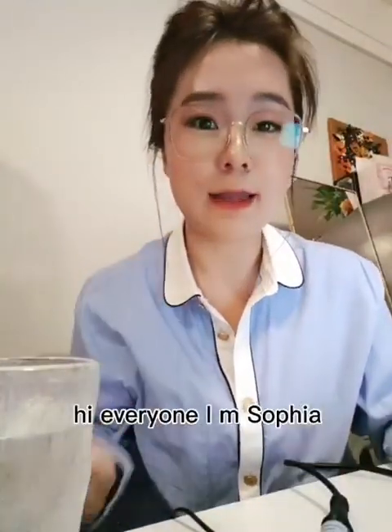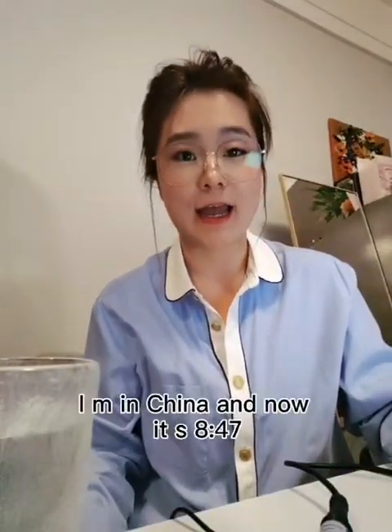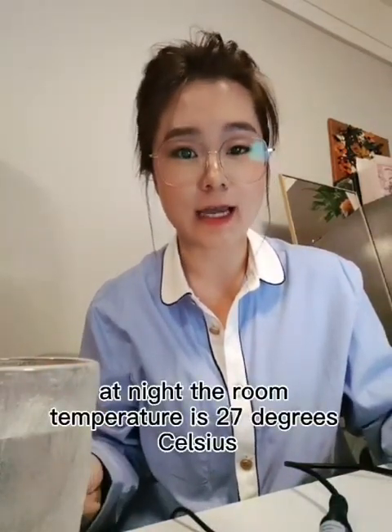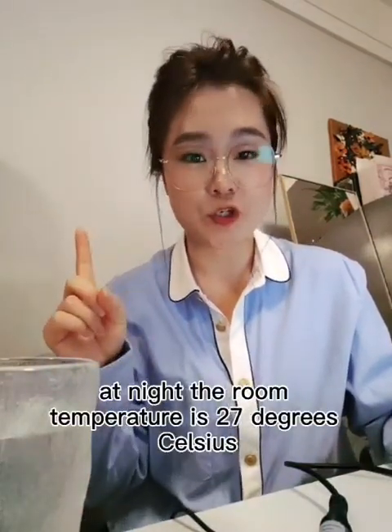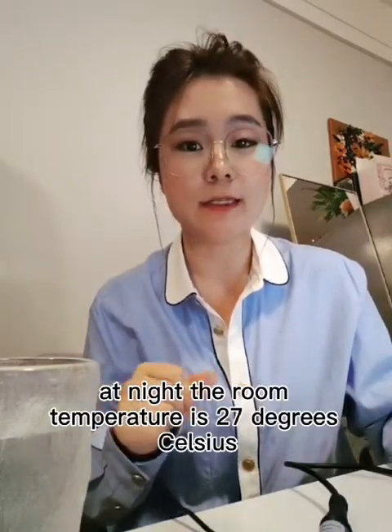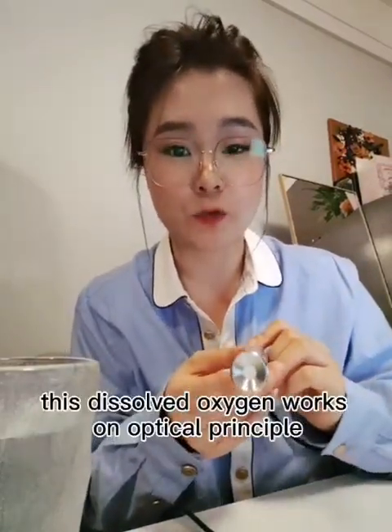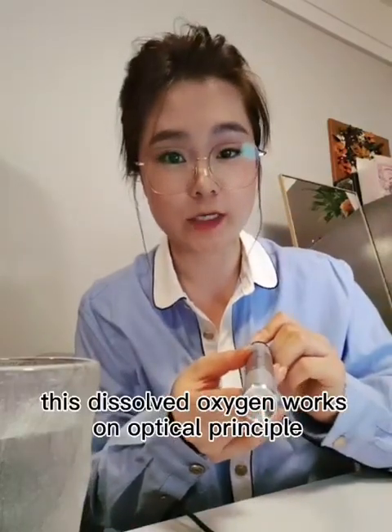Hi everyone, I'm Sophia. I'm in China and now it is 8:47 at night. The room temperature is 27 degrees Celsius and I'm going to show you how our dissolved oxygen sensor works. This dissolved oxygen sensor works on an optical principle.